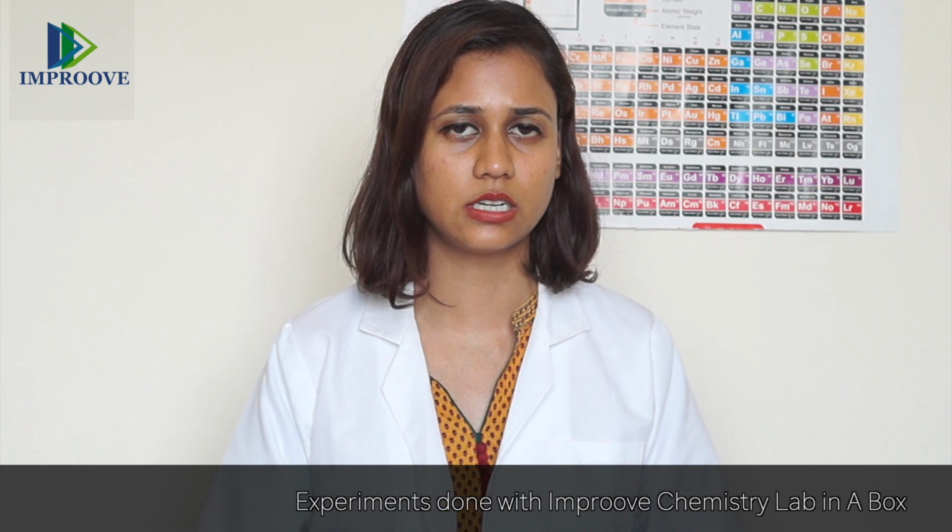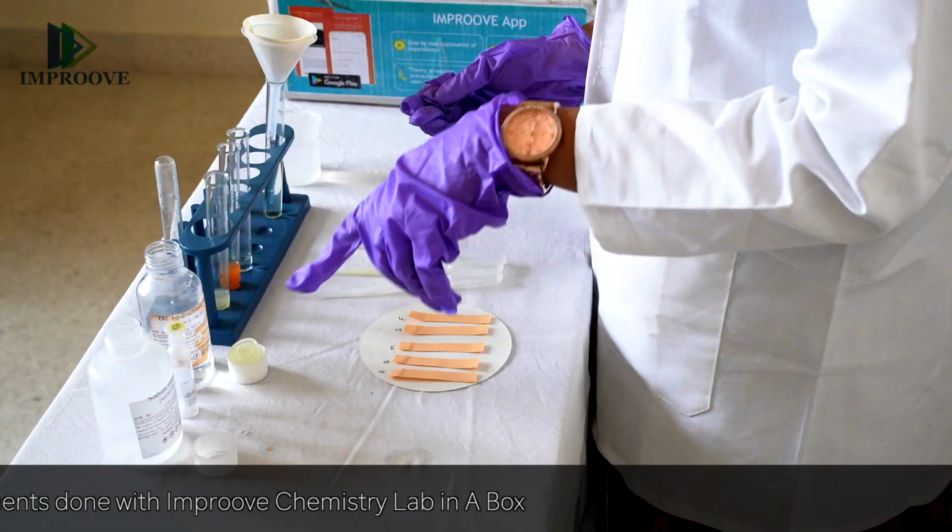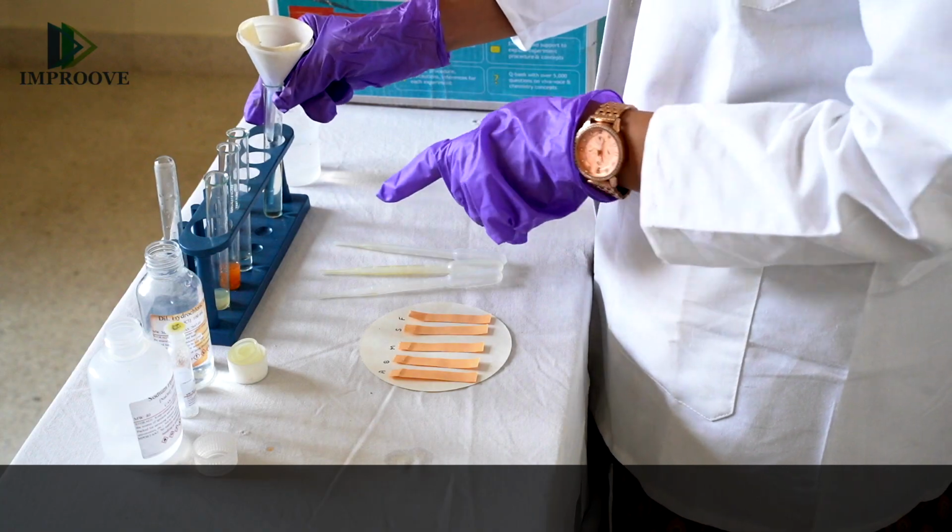For that, you can either consider the juices that you get in the market, or you can consider tomato or lemon juice like we have considered here. And also you will need to test a muddy solution. For that, you can just take some mud, dissolve it in water, allow the sediments to settle down, and then filter them so that you can get a clear solution here.